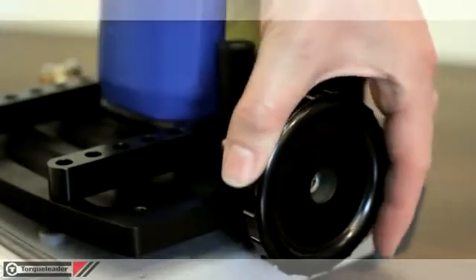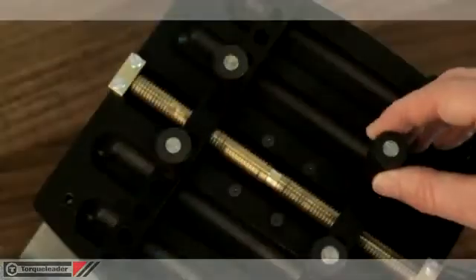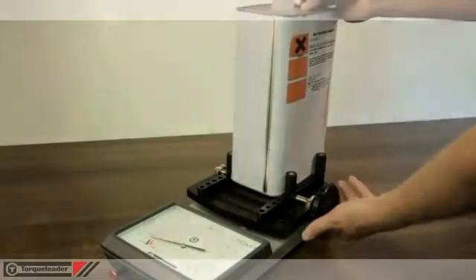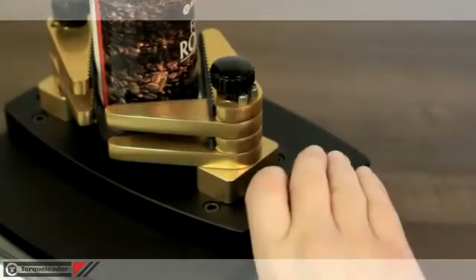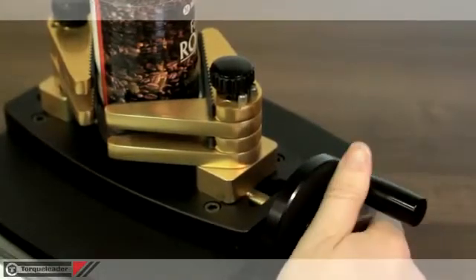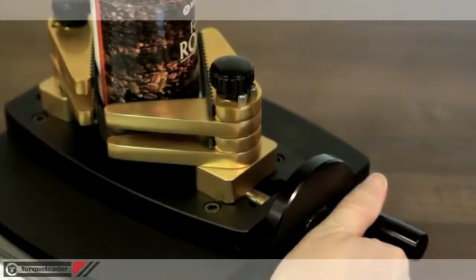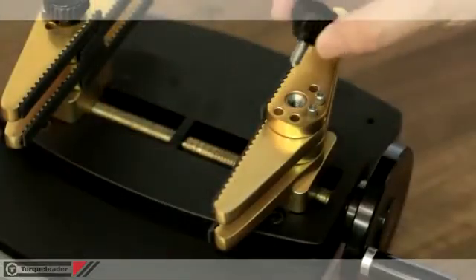The standard clamp features four pegs to grip the container. These can be positioned to accommodate containers up to 200 millimeters in size. The premium clamp is designed to grip delicate or unusual shaped containers up to 135 millimeters in size. The vice jaws can be set in multiple positions.